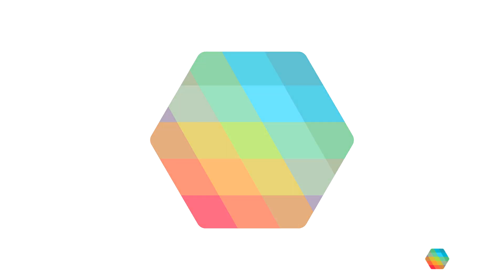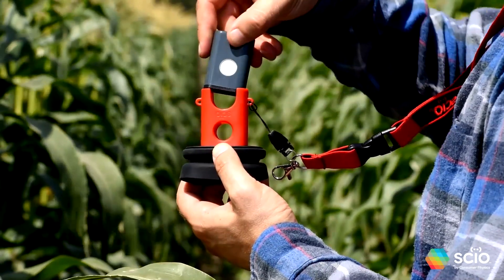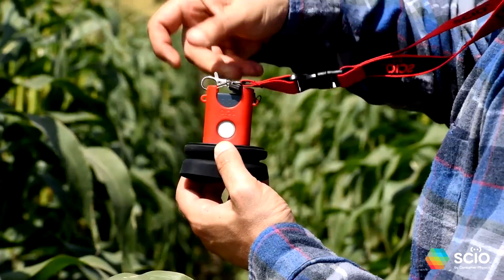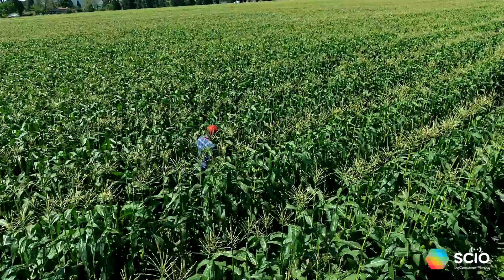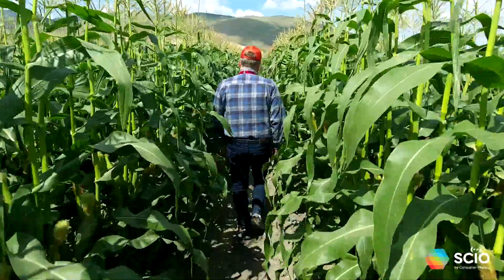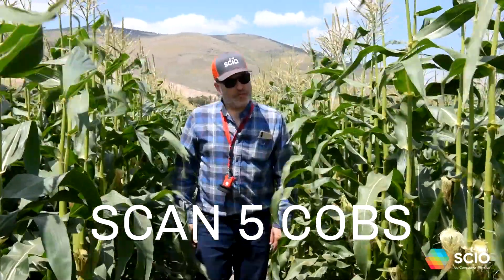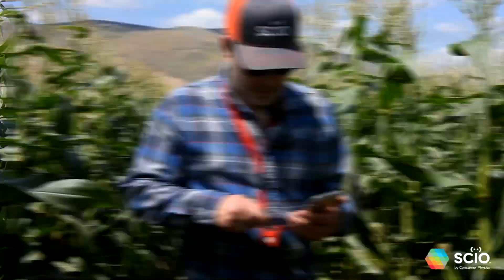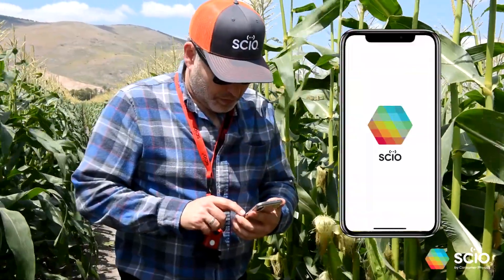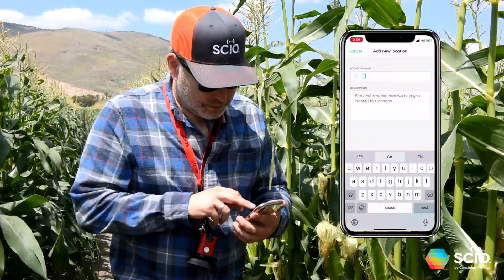Now, let's see how to scan. Insert SIO into the corn adapter with the sensor facing down and fasten the clasp. Pick the field location where you would like to scan for moisture. You will scan five different cobs to get the average moisture in this field location. Turn SIO on, launch the app, and select the corn ear applet.